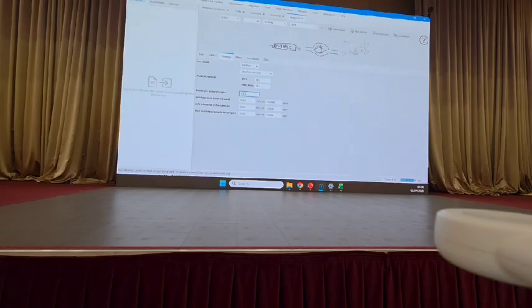What I would recommend, if you are unsure, is, for those who were at the first session that I showed online, and if you weren't there, I'm assuming you're familiar with how to inspect raw data: open up a couple of chromatograms of your analysis, find a specific metabolite or feature that you're interested in, create the XIC, and take a look at that XIC and the XIC of the isotopes.